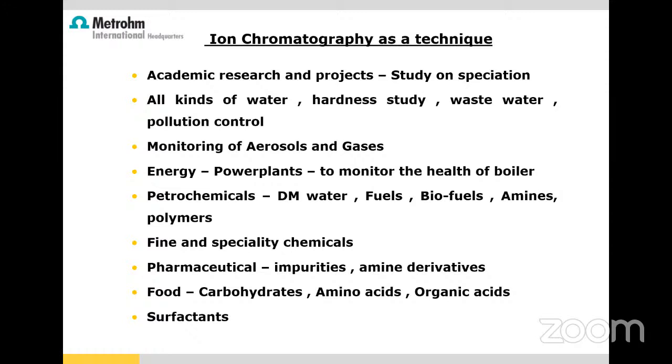Amines, polymers, fine and specialty chemical industry, pharmaceuticals. We are taking tablets, right? We are taking tonics. There are infusion solutions, injections available. So in those, impurities need to be determined. So we can use it for those ionic impurities we determine using ion chromatography.